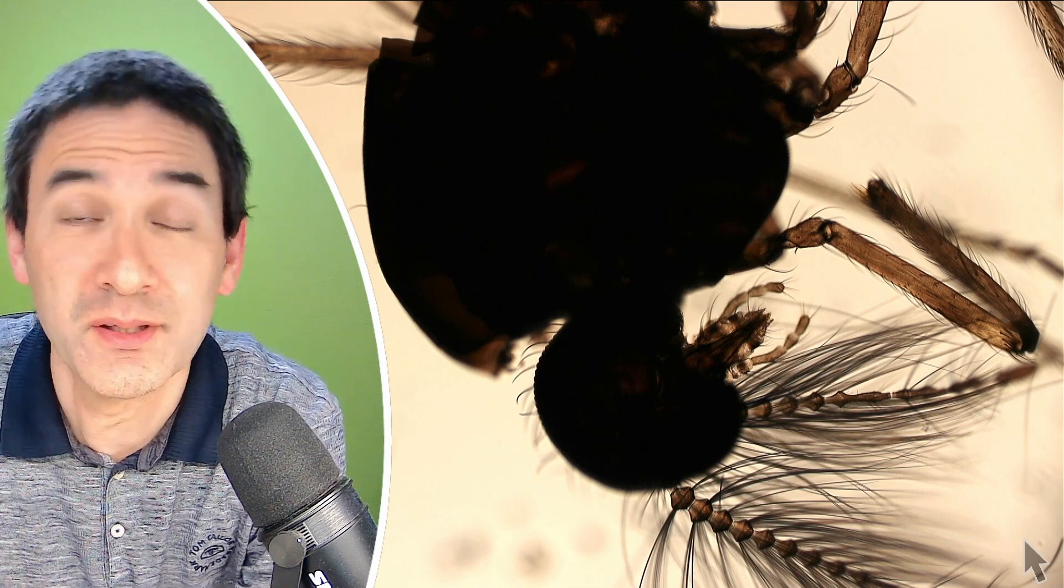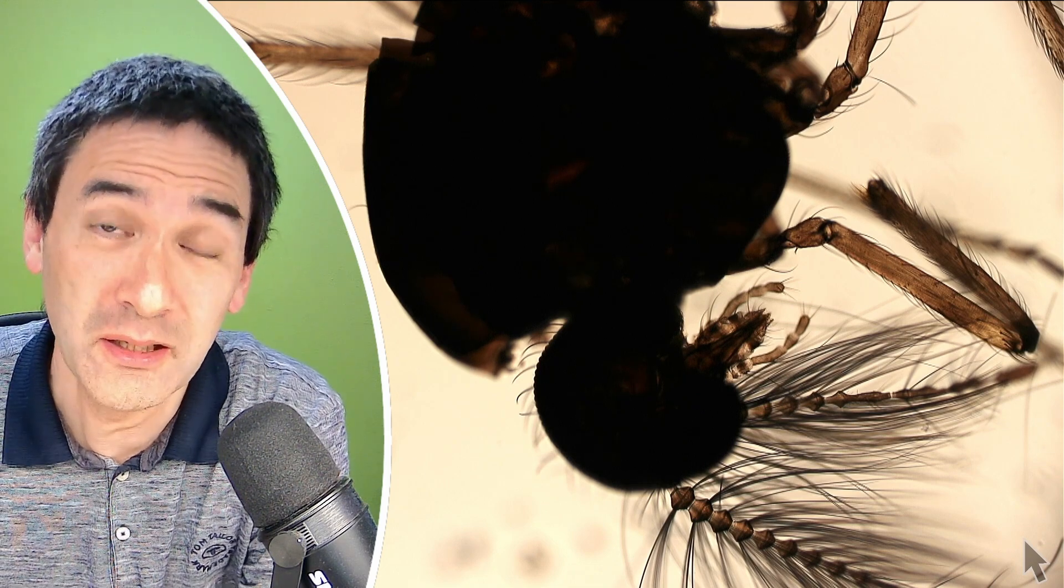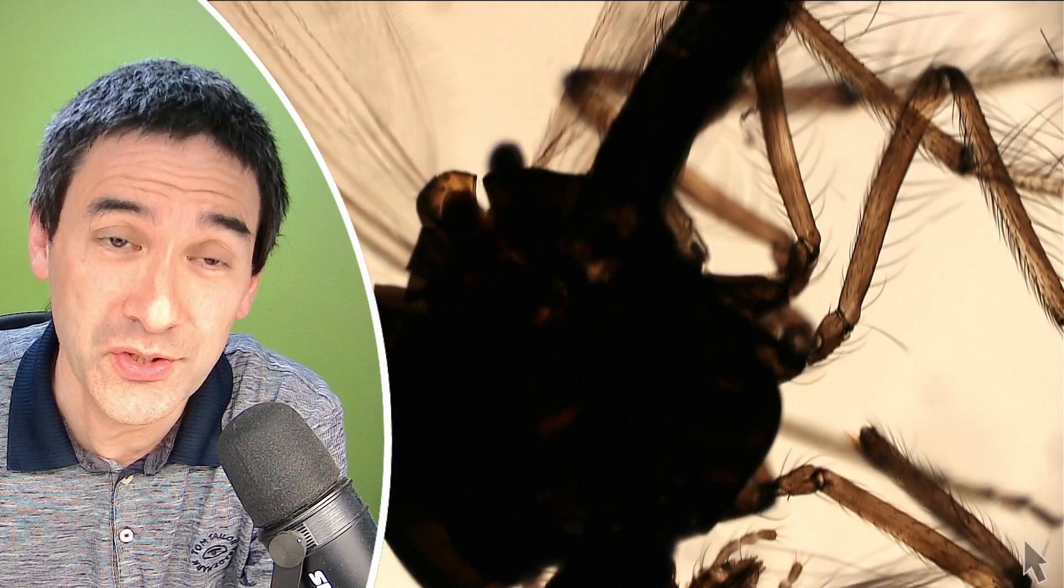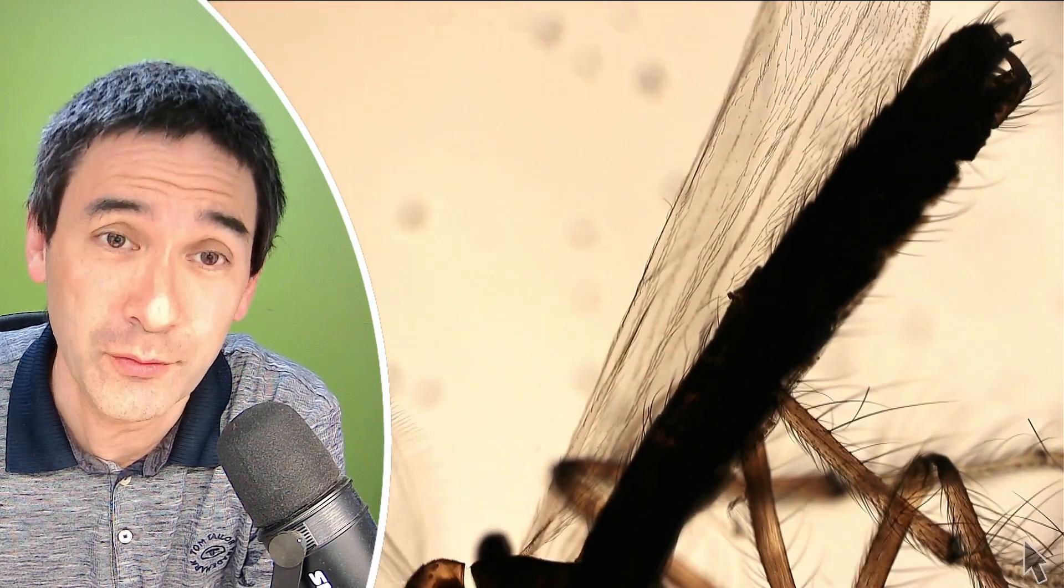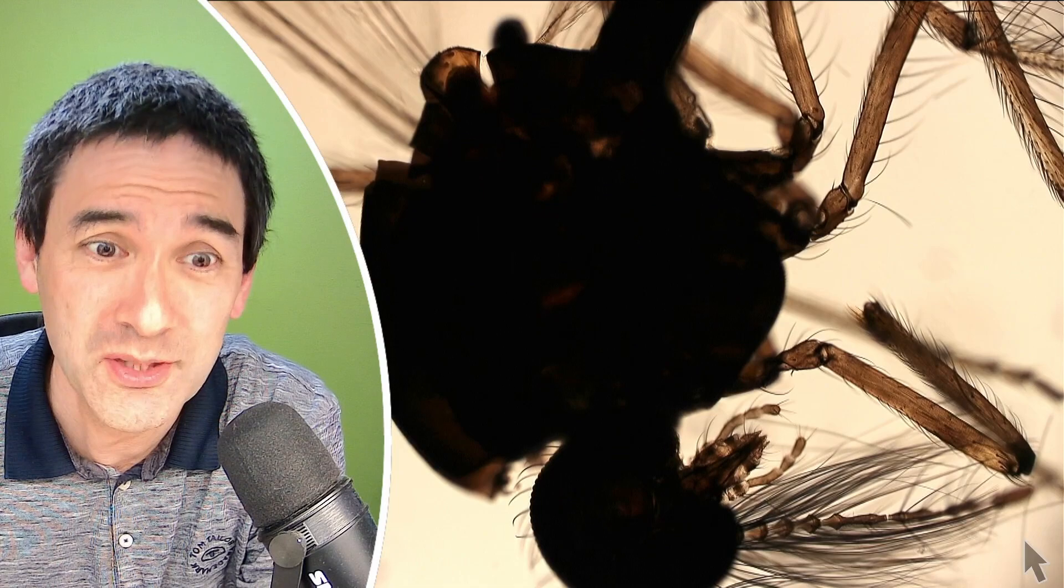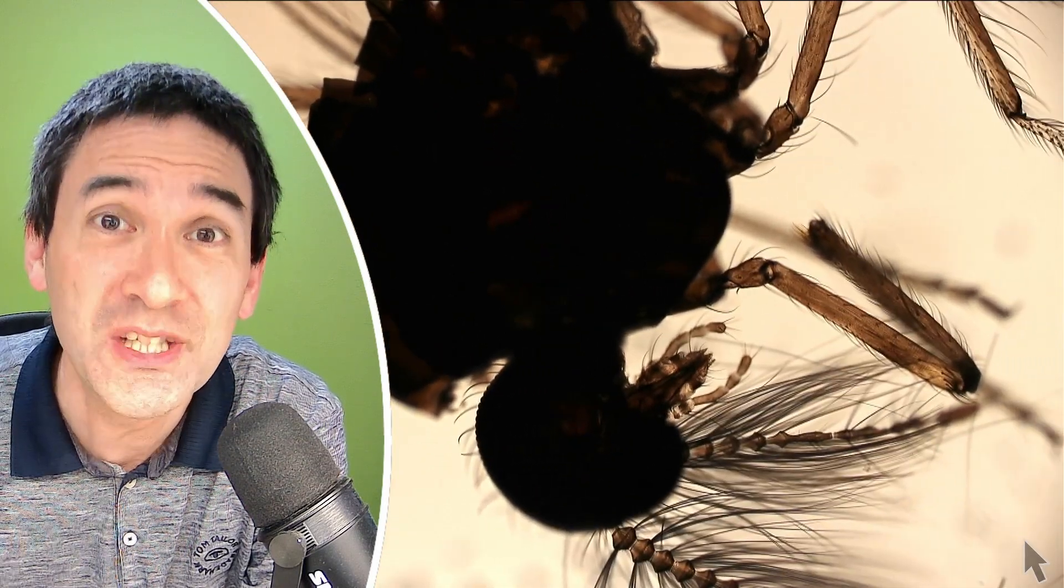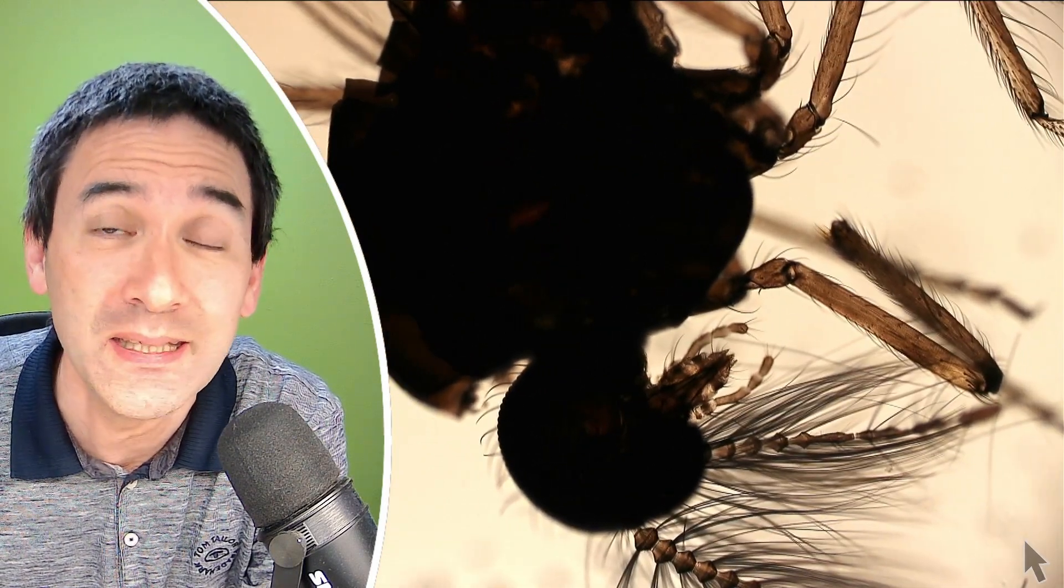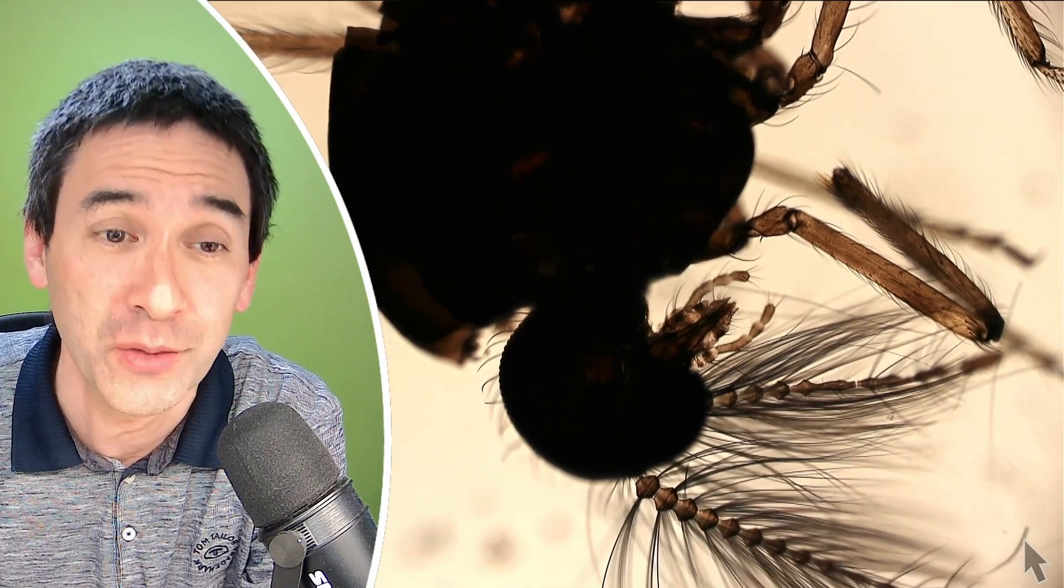Well, a few days ago I mounted some insects that looked a little bit like mosquitoes, and when I looked at them under the microscope, no, these are not mosquitoes. So today I would like to simply show you how you can distinguish mosquitoes from so-called non-biting midges, because that's actually what I think what we've got here.